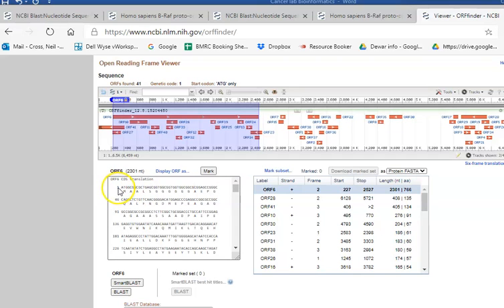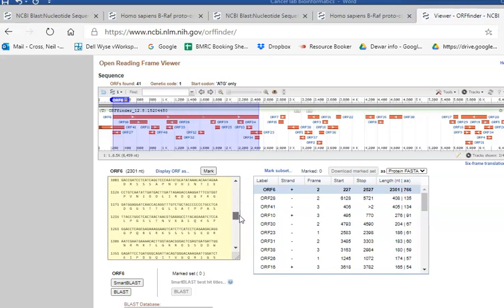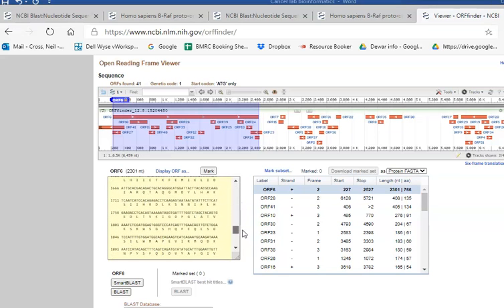If that's base number 1 of the mRNA, or nucleotide number 1 of the mRNA, we know where amino acid 600 will be. It will correspond to approximately base or nucleotide 1800. So we can scroll down all the way down this sequence until we get to about 1800, and there we go. That says 1801.